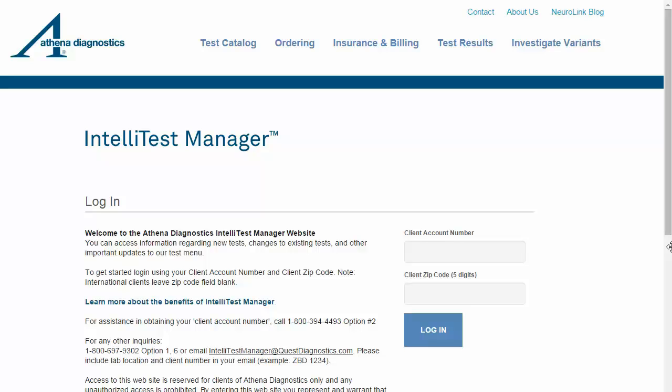Welcome to IntelliTest Manager, a flexible online portal that gives you access to new offerings, information, and test updates from Athena Diagnostics. This interactive demo of IntelliTest Manager will provide you with an overview of the application. To start, go to athena.intellitestmanager.com. Enter your client number and associated zip code. International customers leave the zip code field blank, then click login.